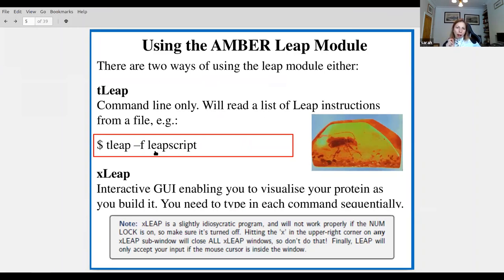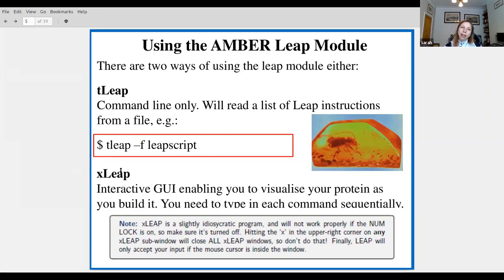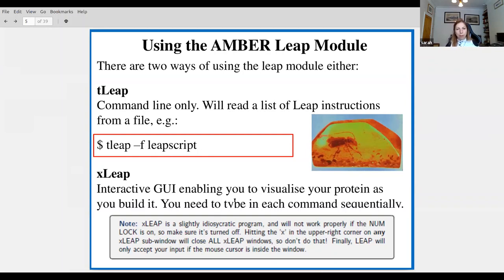We're going to use antechamber to build things. There are two ways to run LEAP: t-leap, which is command-line only, where you put all your instructions in a file — a LEAP script — and t-leap executes them; or you can build interactively using x-leap, which lets you visualize your protein as you build it. I tend to build things first in x-leap, then keep a track of those commands in a script to rerun in t-leap once my setup works.